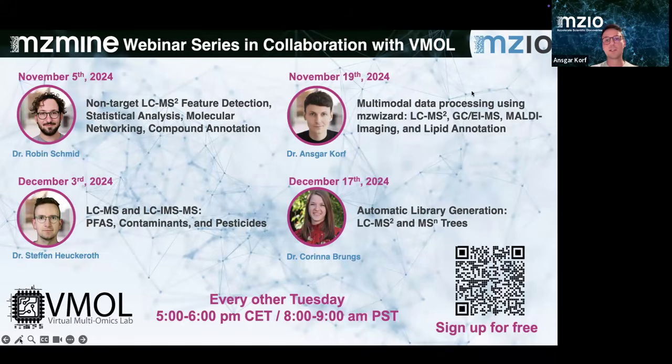In today's presentation, we will also focus a little bit on LC-MS, but also merge into the other analysis techniques that are quite popular in all the laboratories across the world, which also have big challenges, which is GC-MS, especially electron ionization, and MALDI imaging. And for all 3 techniques, I want to focus on lipid identification.